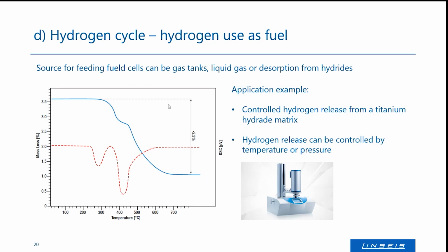What we already did and what we do is we did a lot of measurements regarding thermal conductivity of these membrane materials, regarding electrical conductivity, electrical resistivity of membrane materials, measurement of heat flow of the electrolytes, and yeah, stuff like that. That's what we usually do by DSC, by STA, by thermoelectric analyzers, and that's where we are already involved, and we are or want to be involved in the future as well.